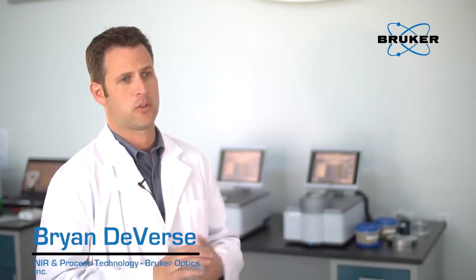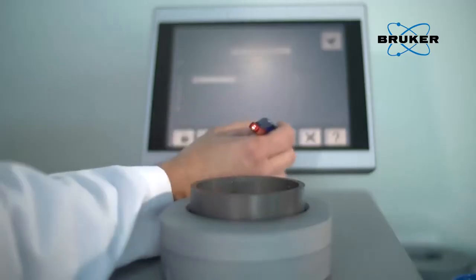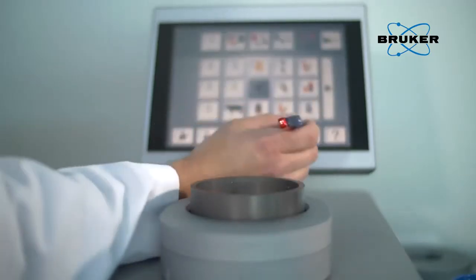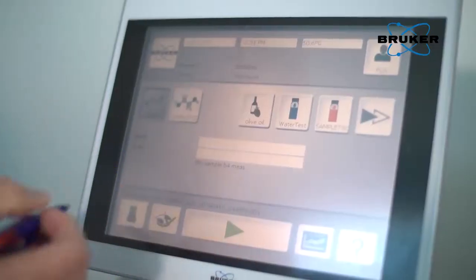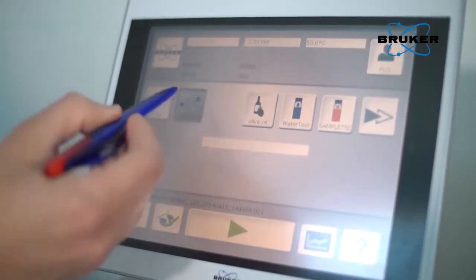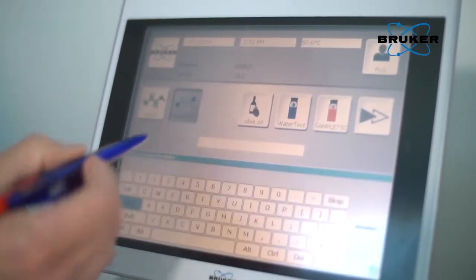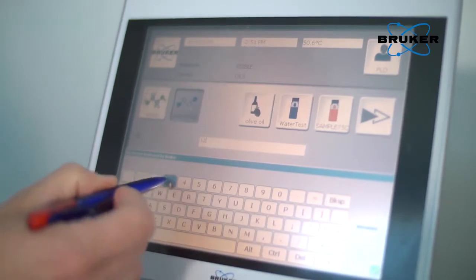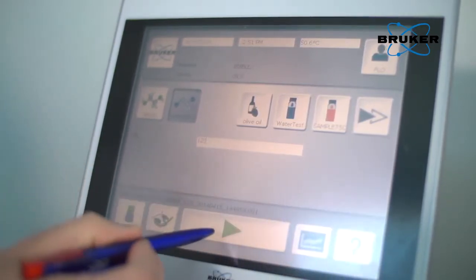The Tango software is a very powerful tool, and yet it was designed to be extremely easy to use, making it ideal for quality control operations. The experience with the Tango software is similar to that one you would have with a modern tablet. Everything is icon based, making it easy to identify the material that you want to analyze and simply touching the icon of interest and making a measurement.